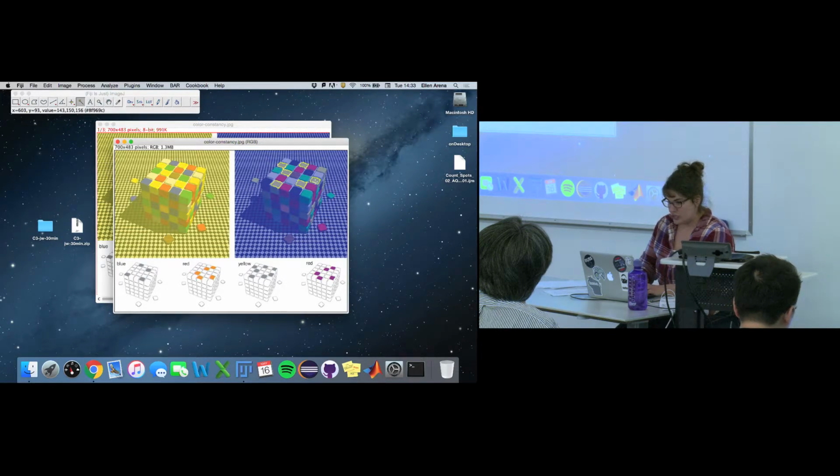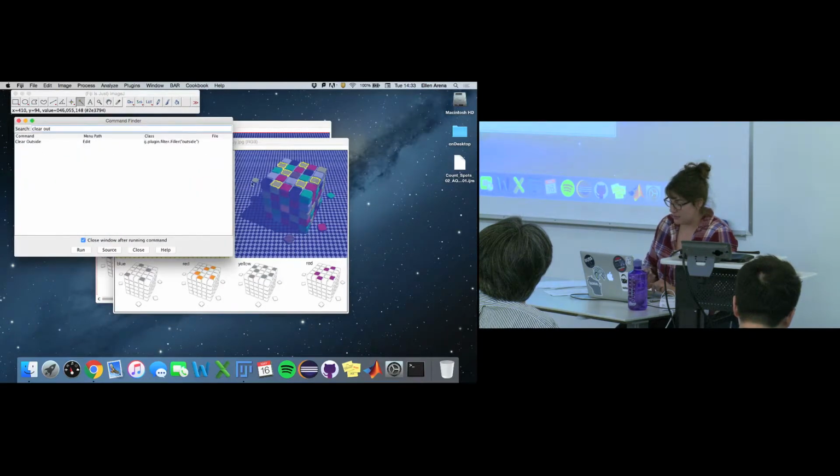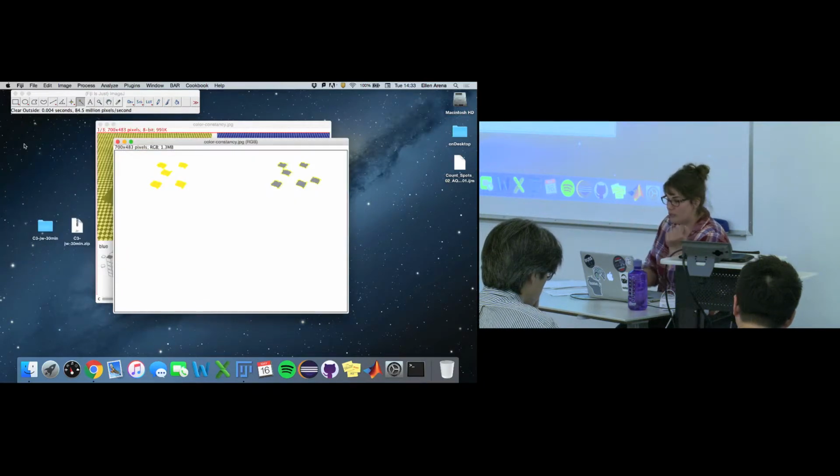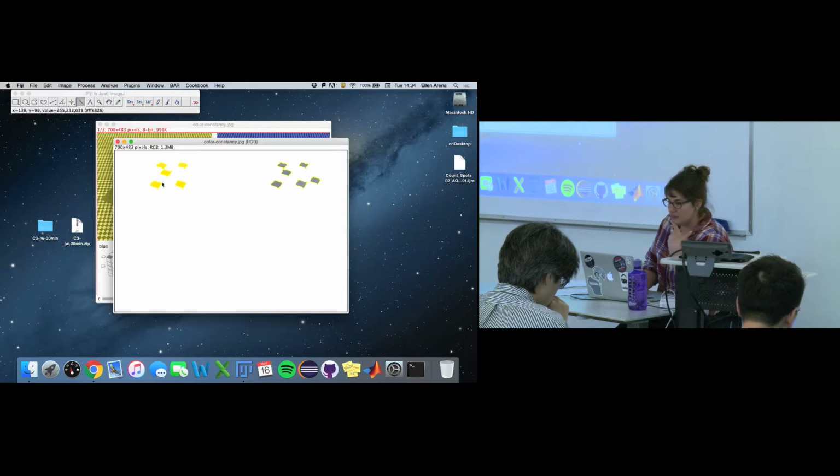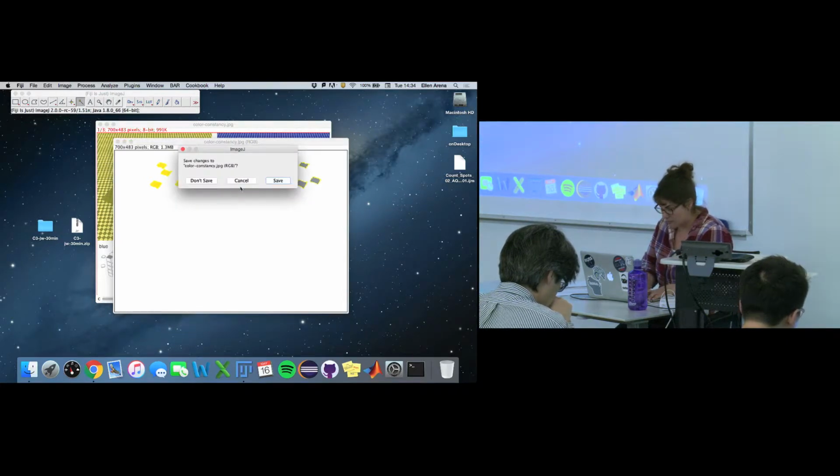And what we're going to do is just clear outside, just to show you that, in fact, they're not all yellow. Again, it's a contextual thing. If you actually probe the values again, you'll see that the RGB values are quite different, right? They're not all yellow. We have yellow and gray squares. But that's also the wand tool, which is a helpful little guy.